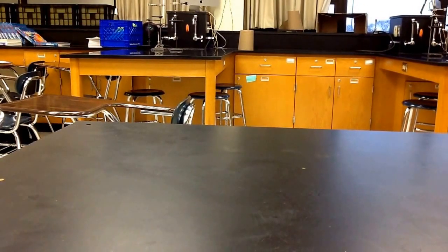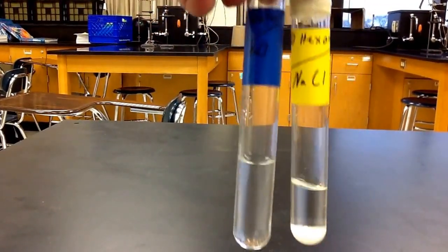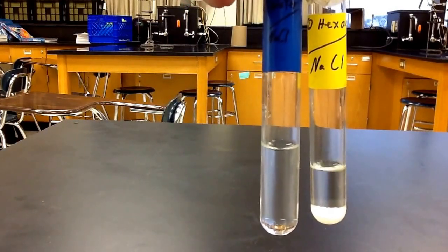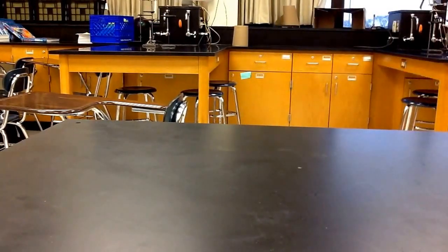Our next one is NaCl, otherwise known as table salt. We should recognize, hopefully, that table salt should be soluble in water and insoluble in hexane. So S for soluble for water and insoluble in hexane. That's NaCl.